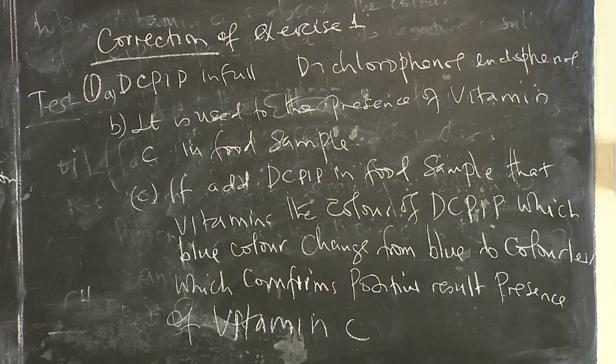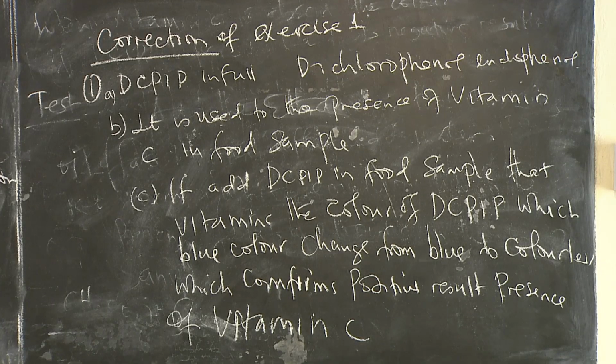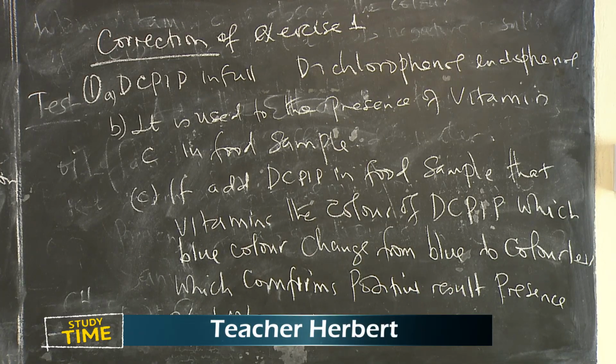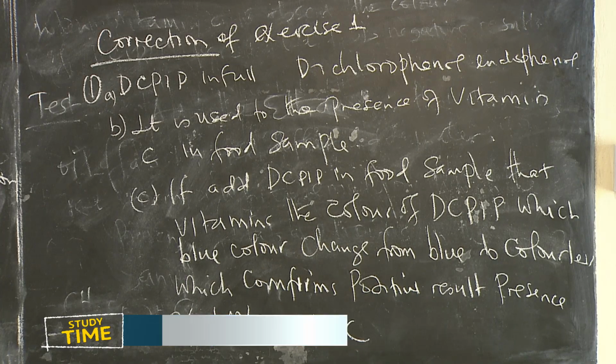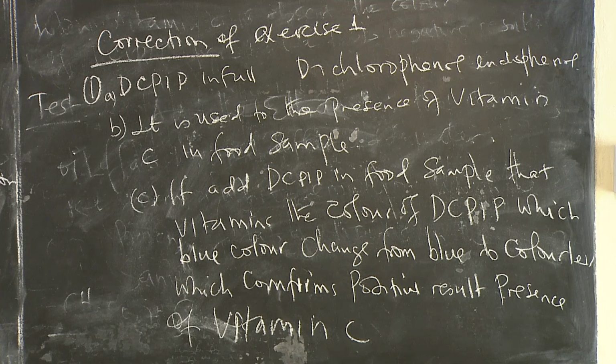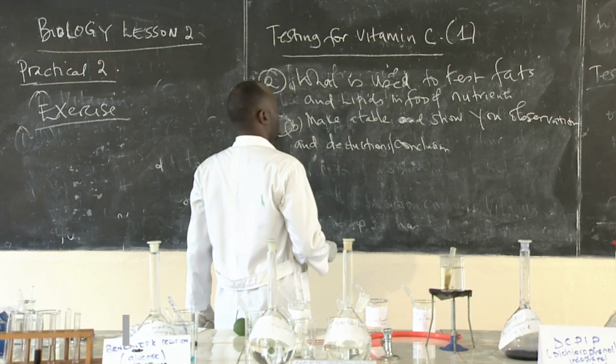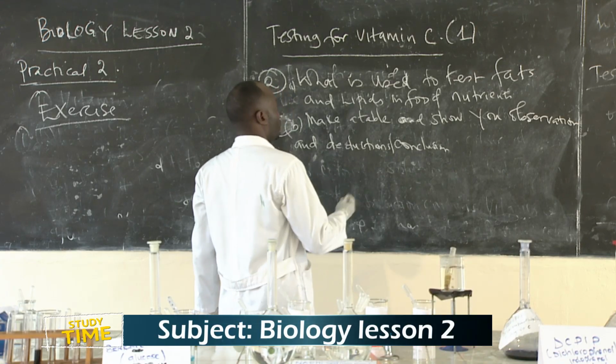Then number 2. We go to part 2: what do we use to test fats? What is used to test fats?